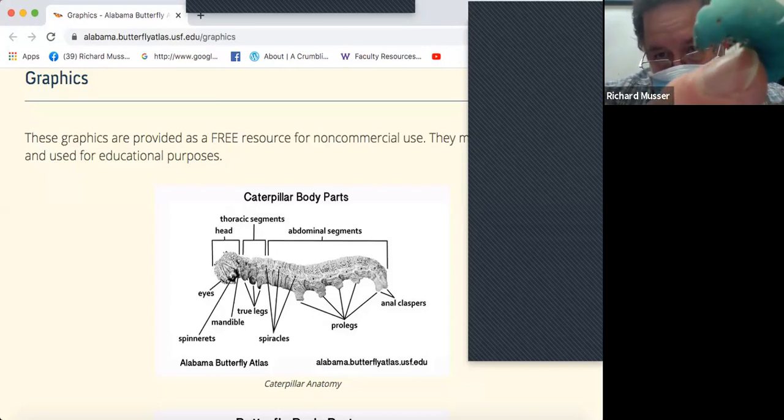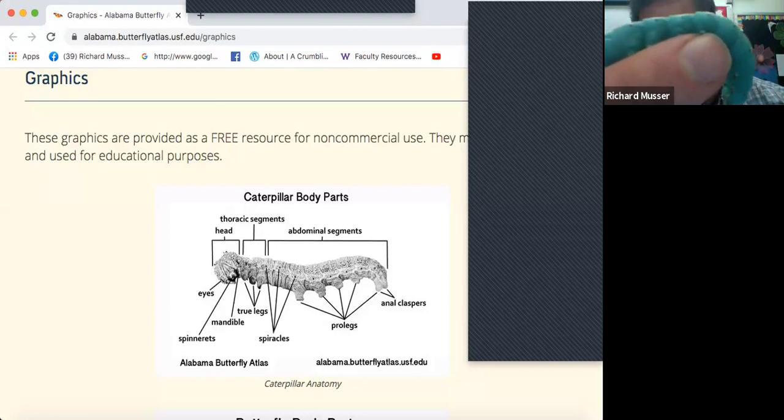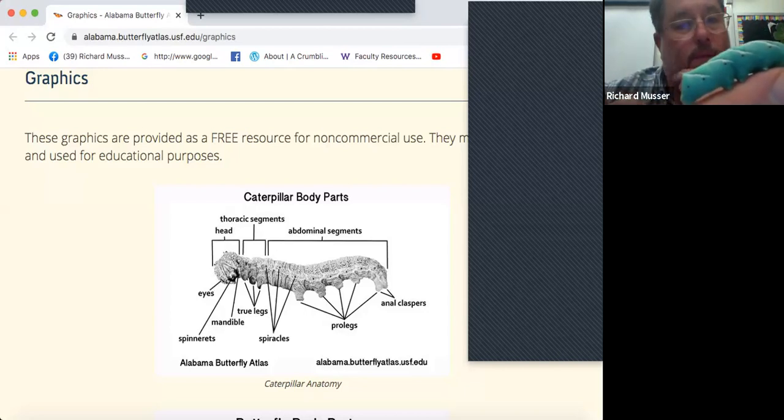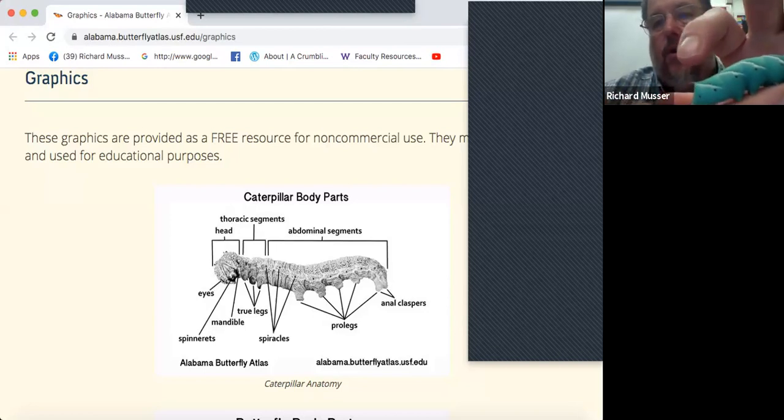That dot there is actually a spiracle. All these little dots you see along the side of the body are what we call spiracles. Spiracles are openings that can open and close. They'll close if they fall in water. They allow air to enter the insect. Caterpillars don't breathe air directly through their mouths - they're breathing through these holes called spiracles.